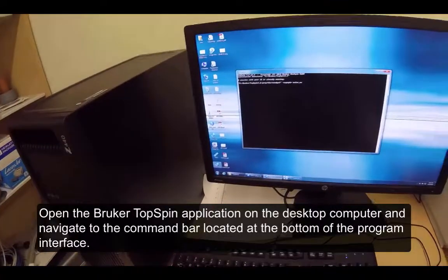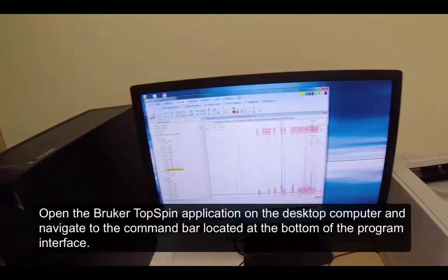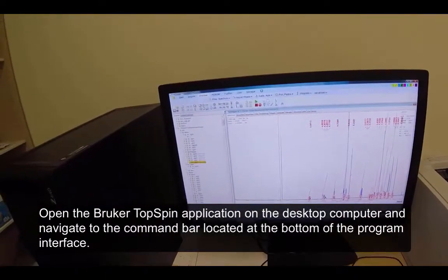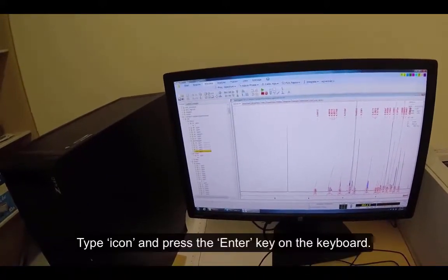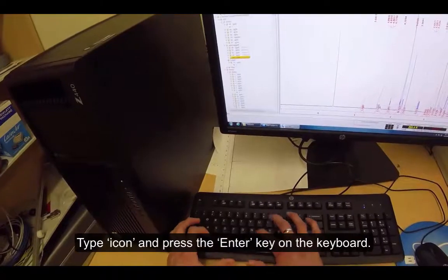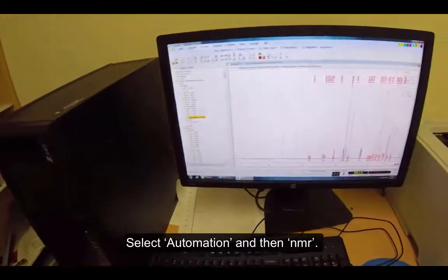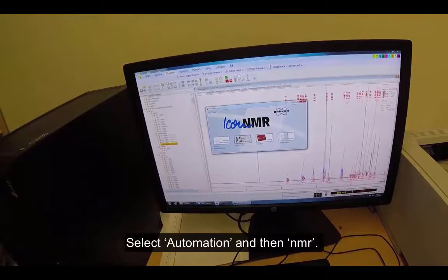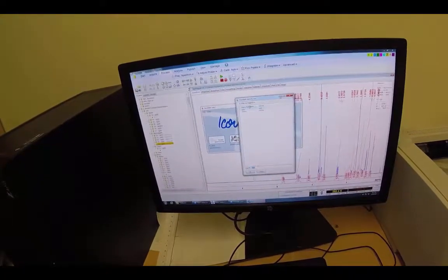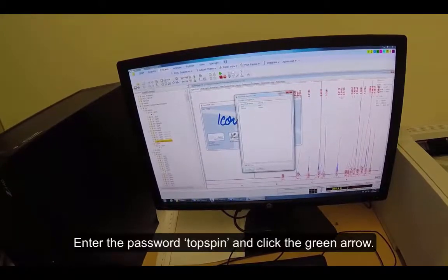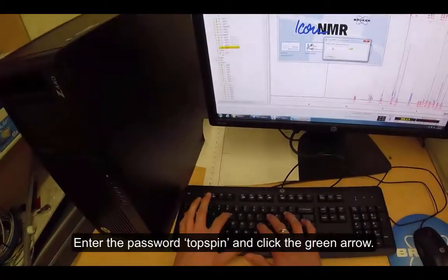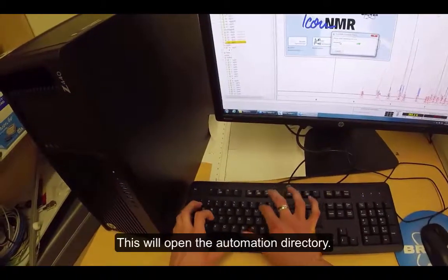Open the Bruker TopSpin application on the desktop computer and navigate to the command bar located at the bottom of the program interface. Type ICON and press the Enter key on the keyboard. Select Automation and then NMR, and press OK. Enter the password TopSpin and click the green arrow. This will open the automation directory.